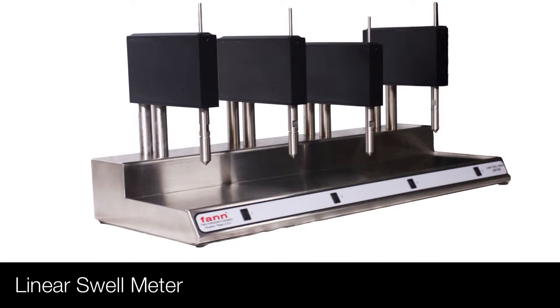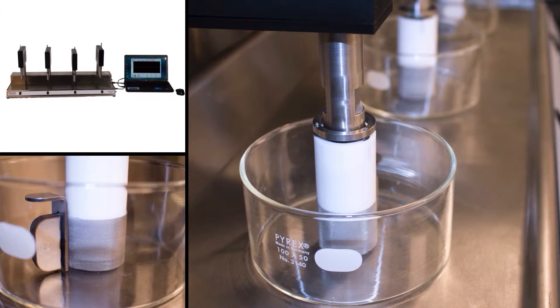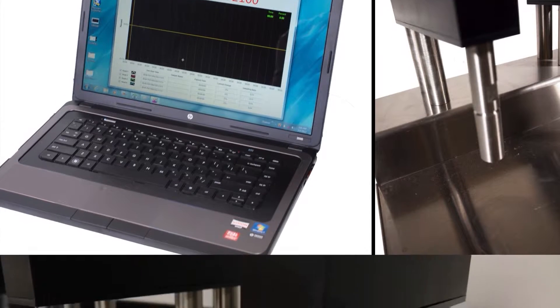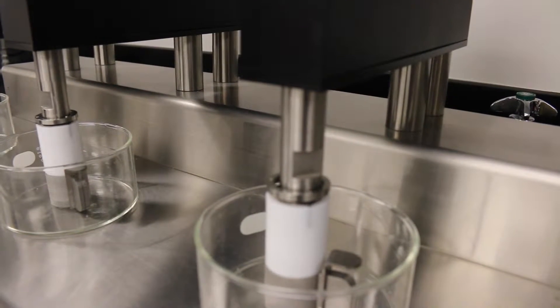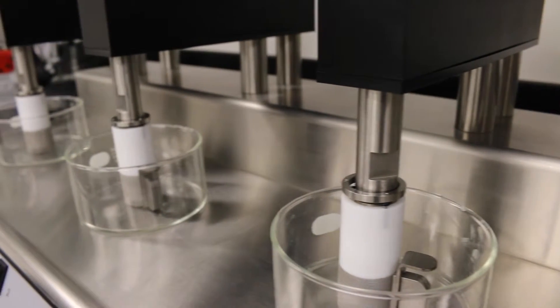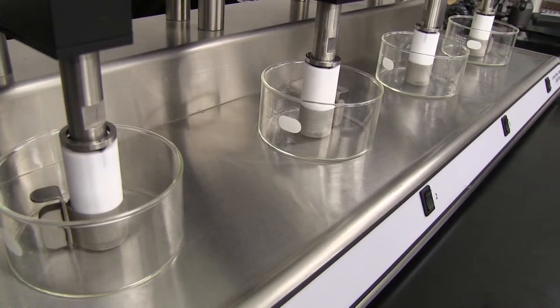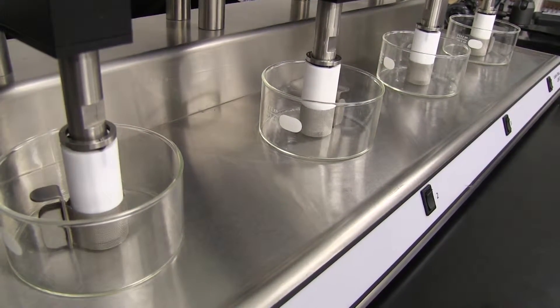This is Fan Instrument Company's Linear Swell Meter, the LSM 2100. The Linear Swell Meter is used to evaluate the stability and reactivity of shale. Shale instability causes drilling problems, such as stuck pipe, tight hole, and washout. With the Linear Swell Meter, mud engineers can predict and prevent shale problems.